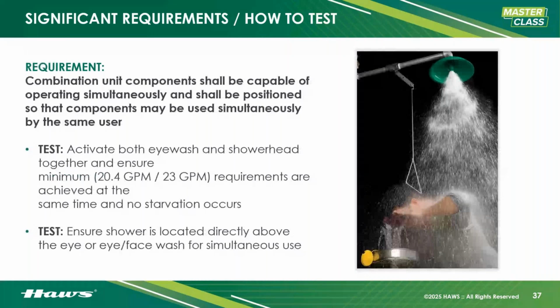Now, combination unit components shall be capable of operating simultaneously and shall be positioned so that the components may be used simultaneously by the same user. Can't tell you how many combination units or other emergency equipment I found where the shower head was pointing one way and the eye wash was pointing the other way. This is designed for one person to use at the same time, simultaneously. Okay, you cannot have, go this way to rinse your body and go that way to rinse your eyes. This is designed for one person.